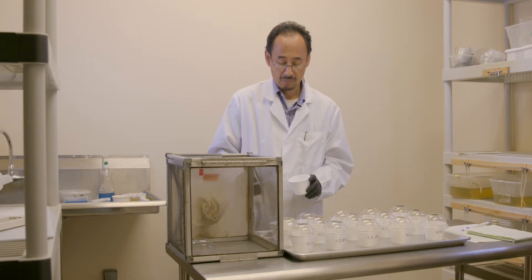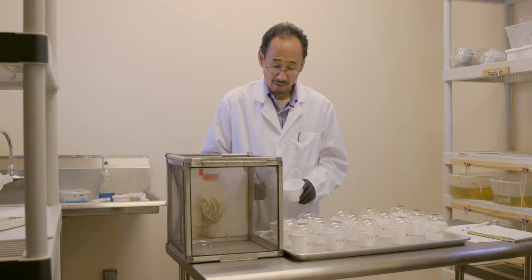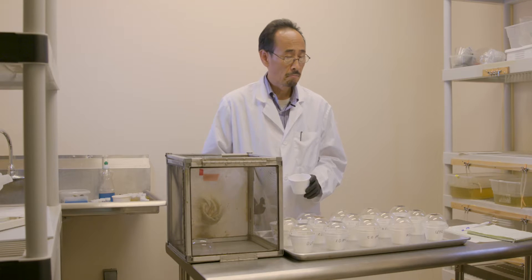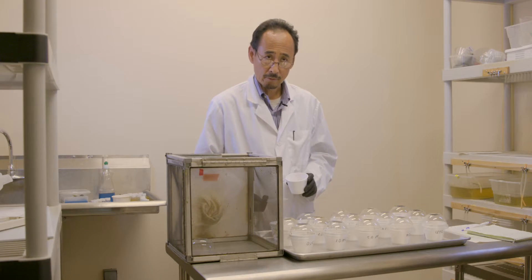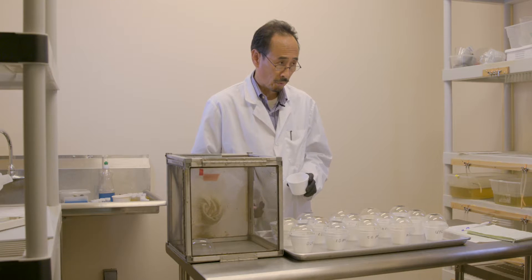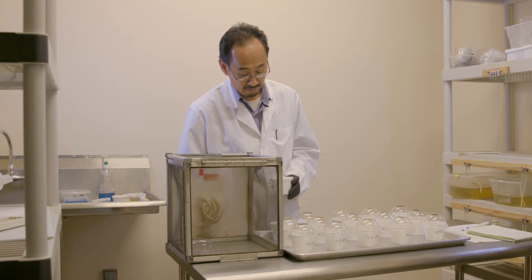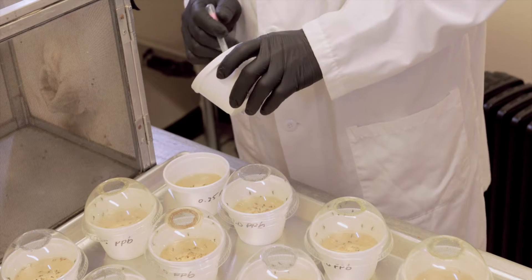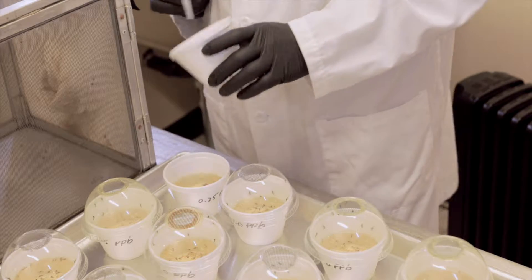If you expect 10% mortality at the beginning with 25 larvae, you should get 23 or 22 around that neighborhood pupal skins. You're going to have a couple, three dead ones here. Do not count ones that are attached to a dead or dying adult. Those are considered as dead. That's how you read results. Then you flip your number. I got 23 pupal skins here. What's the dead ones here? Two. Two are dead. You're going to record that two as the number of mortality. You do this for all cups.